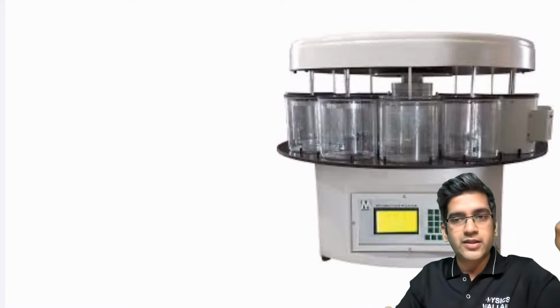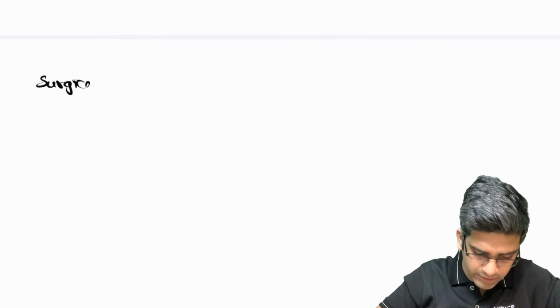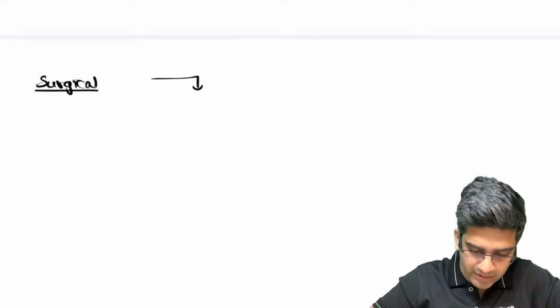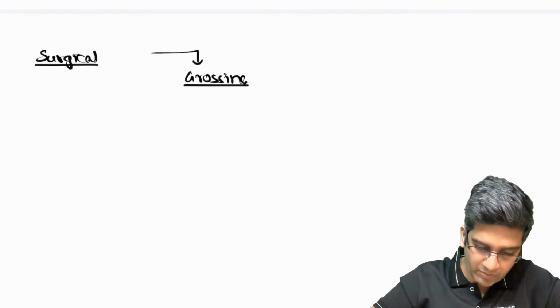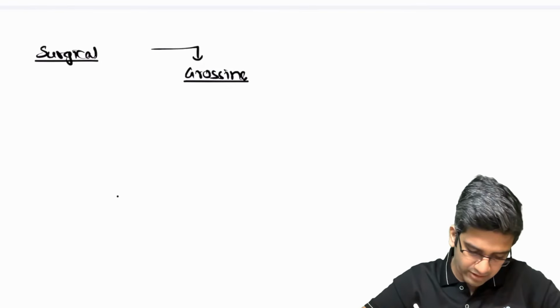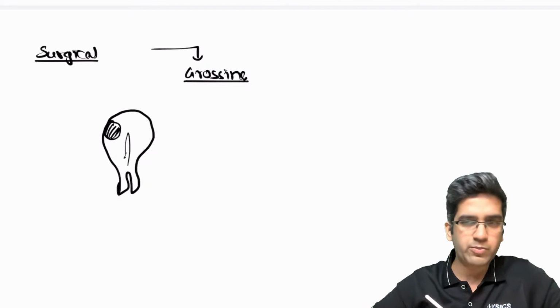So what happens is, every day the biopsy comes, the flow is simple. The biopsy or the surgical specimen comes to the pathologist. Once the surgical specimen comes, the pathology PG or the assistant does something called grossing. Grossing means what we do. Let's say you have a sample of hysterectomy, fine, for a fibroid uterus. Okay, let's say it's a cut open surface of a hysterectomy with a fibroid uterus.